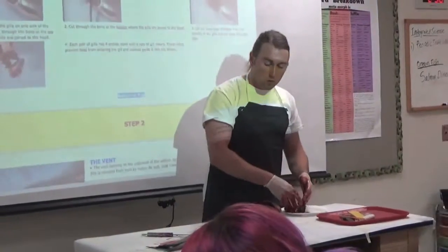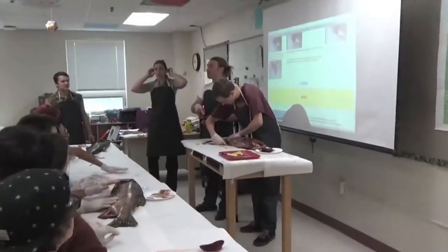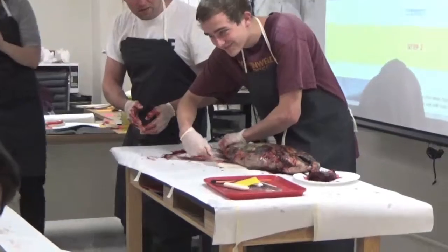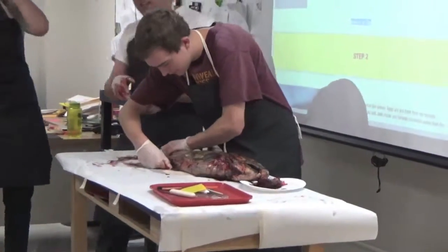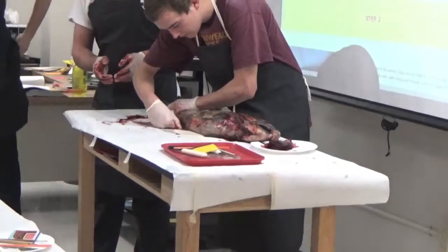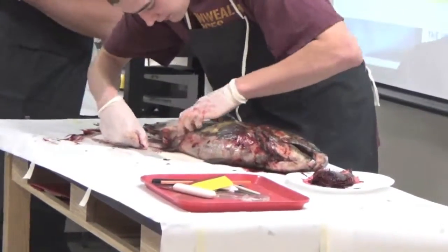When everybody's got those out, we'll move on to the next piece, which is to actually open our fish up. Brendan is an avid fisherman, so he's done this a couple of times. What he's doing is opening up the fish. He's starting at the anus — that's the entryway.